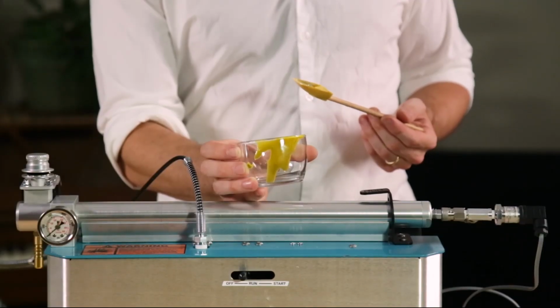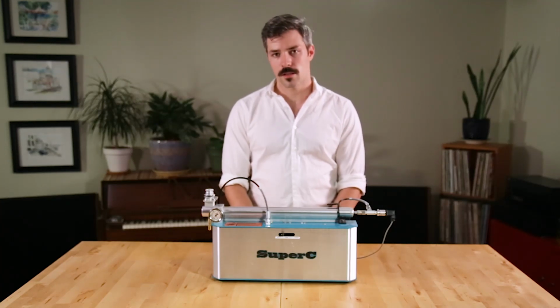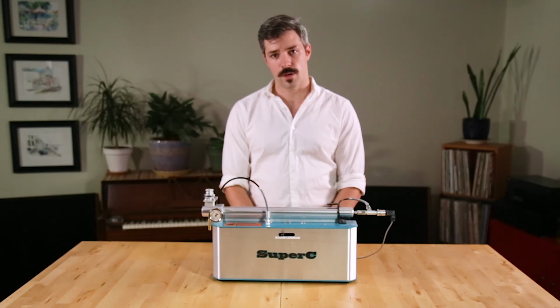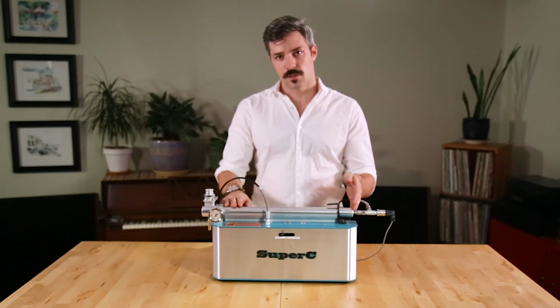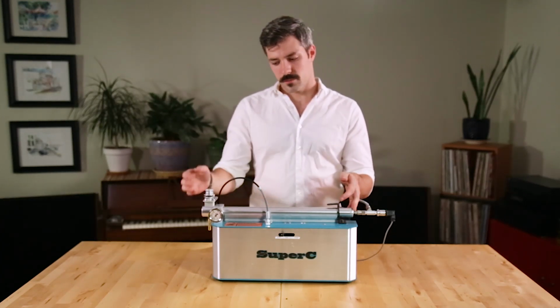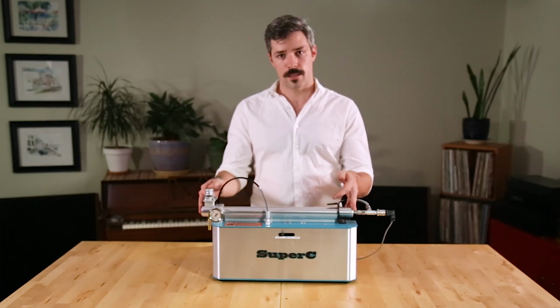Between runs, you'll want to clean your system. The level at which you clean it will depend on the frequency at which we've been running it, as well as the needs of your project. Regardless, all of the cleaning happens downstream of this fitting. The chamber which held your material and the valve through which your extract passed are the contaminated parts which should be cleaned.